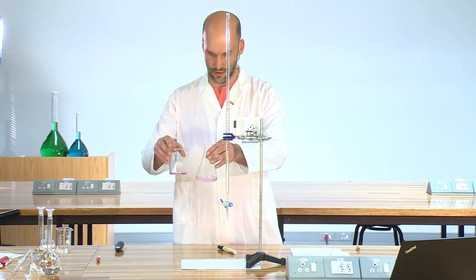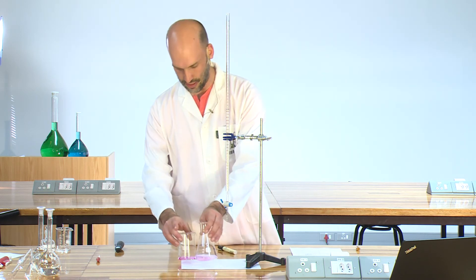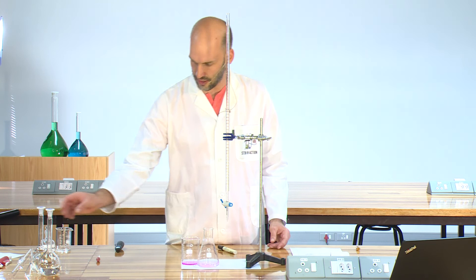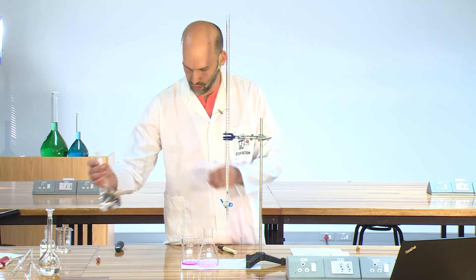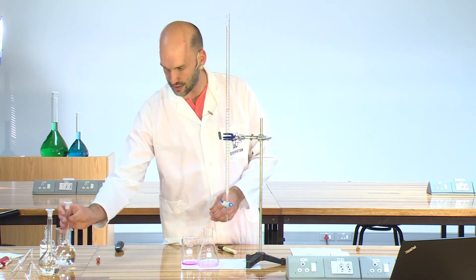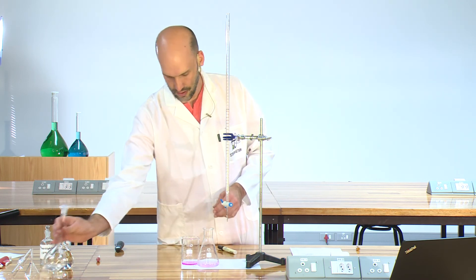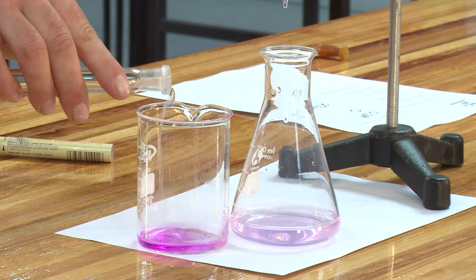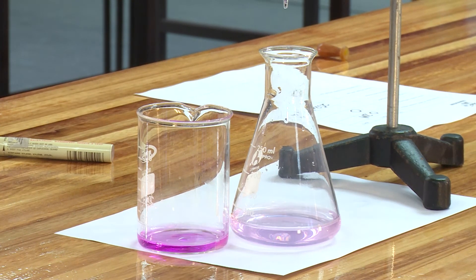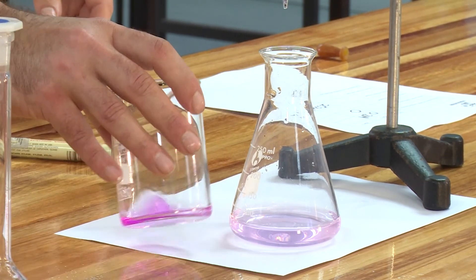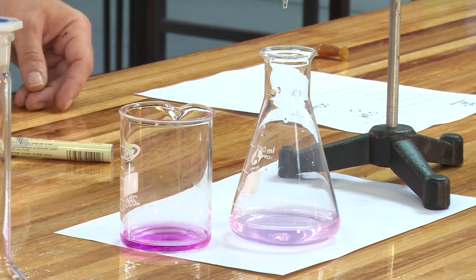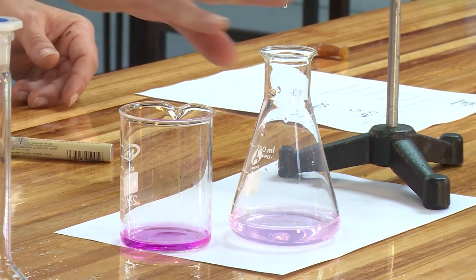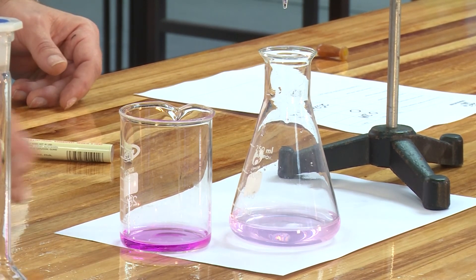As you can see, one color is darker pink and the other is lighter pink. You can see that the darker pink compared to the lighter pink confirms which one is our endpoint - the lighter persistent pink is the correct endpoint.